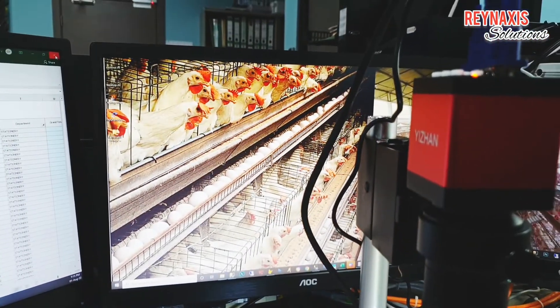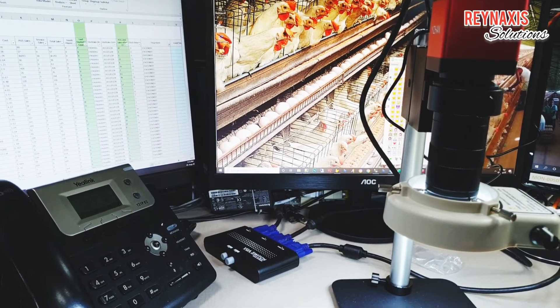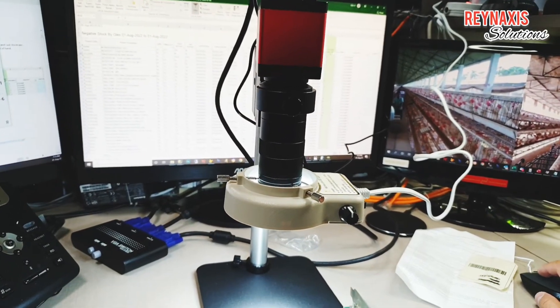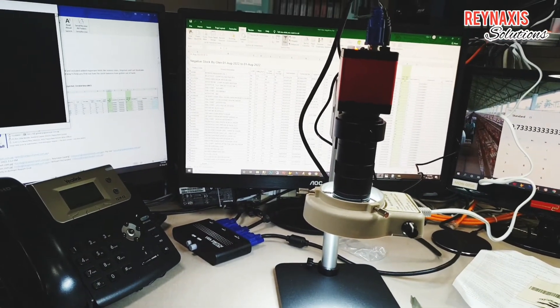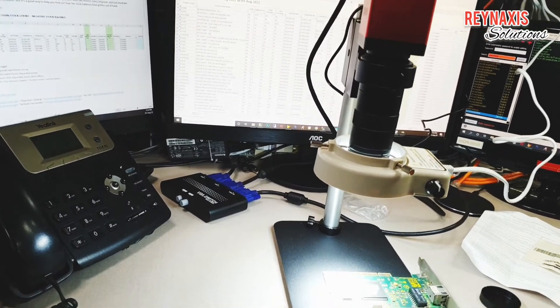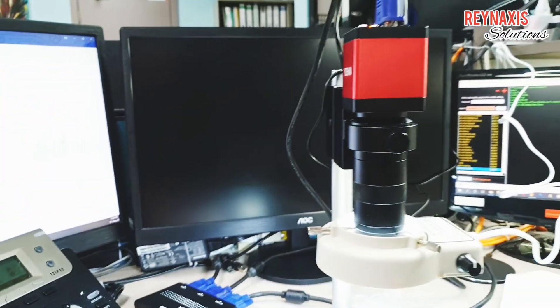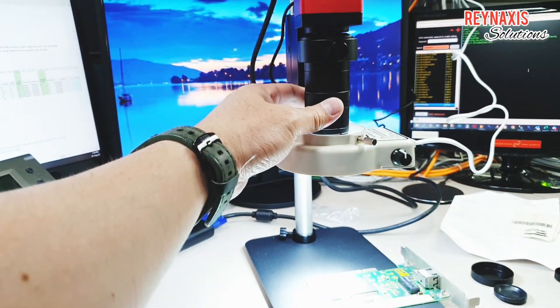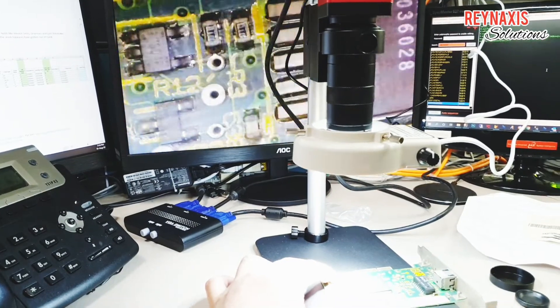Now I'll test my VGA switch to see if it's working properly. I'm going to span my screen across open apps and then switch the VGA switcher to the microscope. Once you switch back to the microscope it may not show anything at first — just do something underneath or turn the focus knob and it will go back to showing what's beneath the camera.